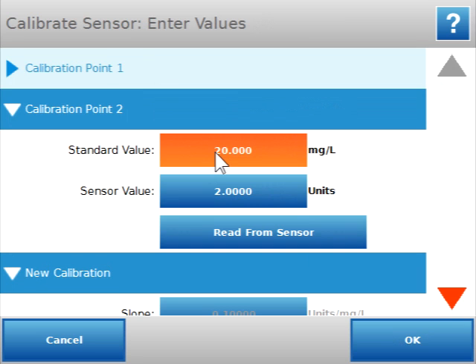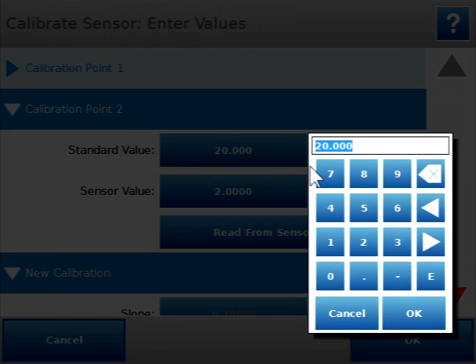We can now enter our calibration value into the standard value. Again, for my sample, it was 9.1 milligrams per liter.